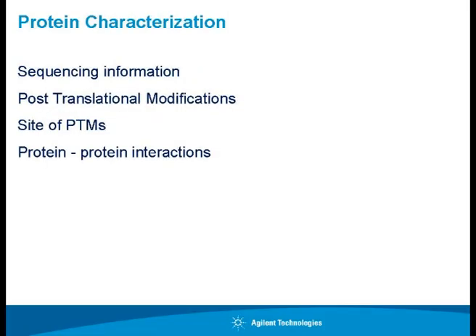The second step, characterization, is that you sequence it and identify what the modifications are. The protein can be in native form, or it can be in modified forms, and you identify the sites where it is modified. That is the characterization, and then interactions, and then quantification, either absolute using iTRAQ sort of technology, or label free, differential.